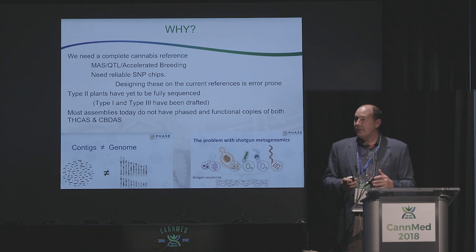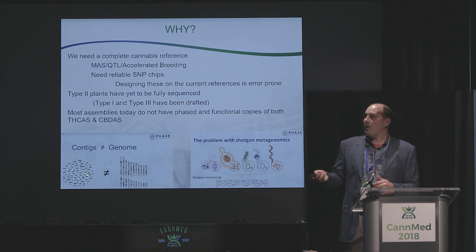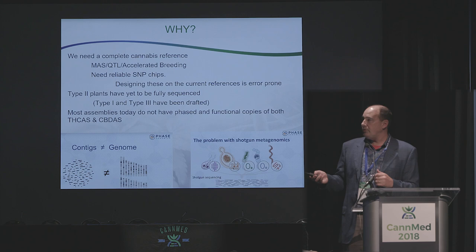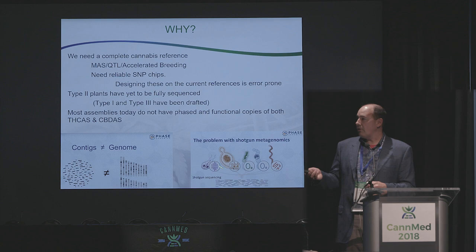Now, some terminology here. You're probably used to hearing about contigs. This is what a normal assembly turns into, a couple hundred thousand of these, and we really want to get it into chromosomes like this. There are technologies from Phase Genomics and PacBio that help do this, which we'll touch on. But this is really important for you to understand where those chromosomes came from, like if they're in certain organelles or if they're in certain microbes that often contaminate genome assemblies.